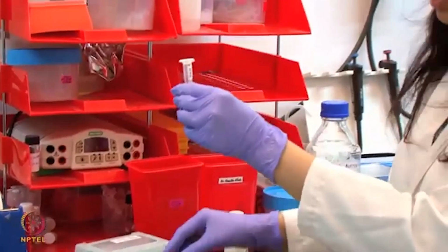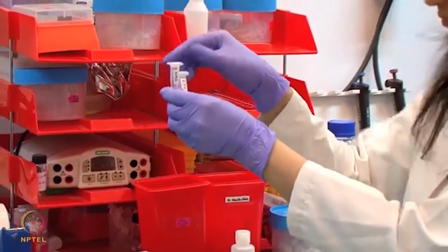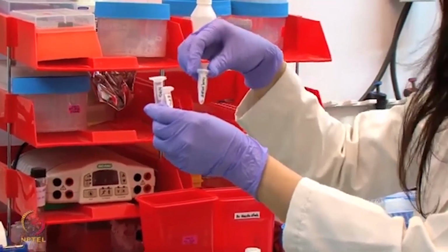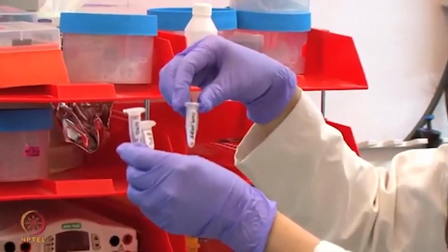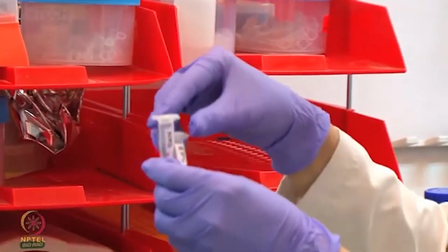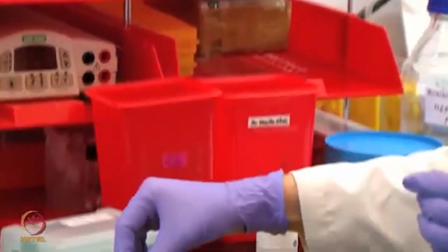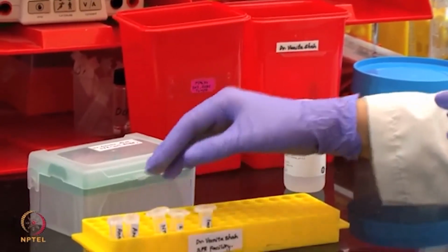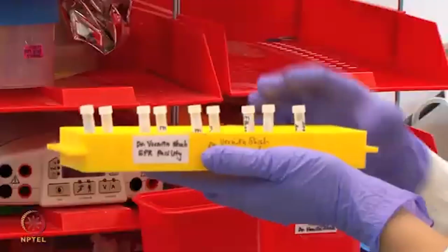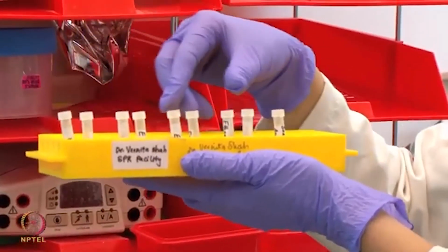Aliquots of NHS, EDC and ethanolamine are prepared and transferred to the specialized tubes used for the system. We have now transferred all the reagents into these specialized tubes.